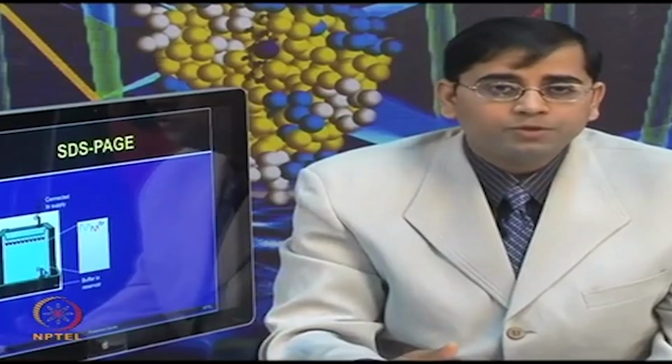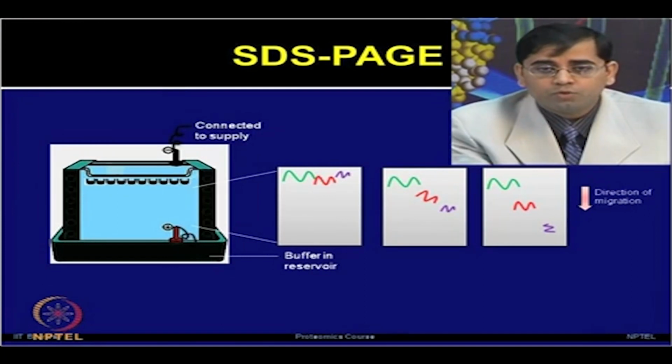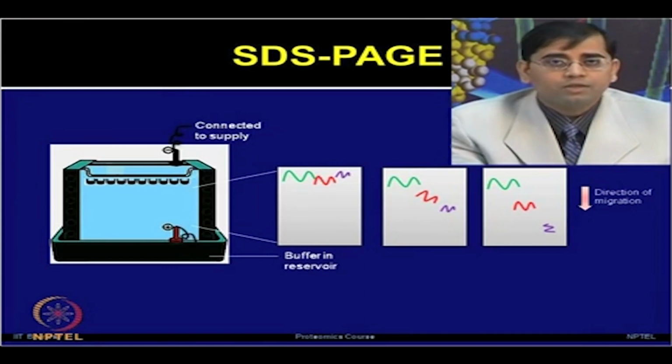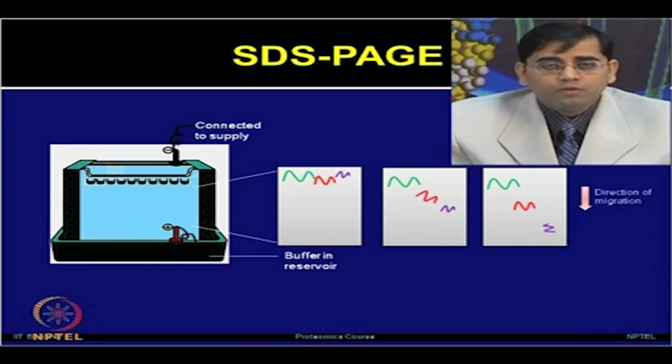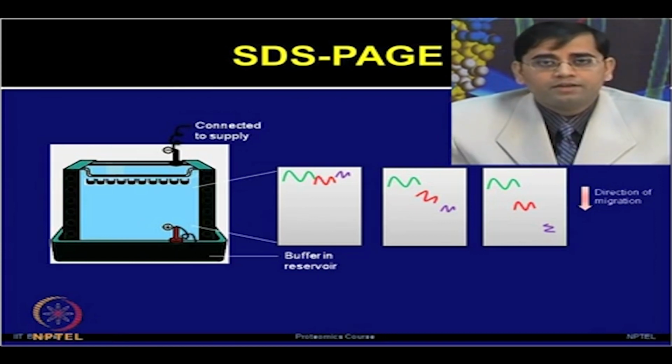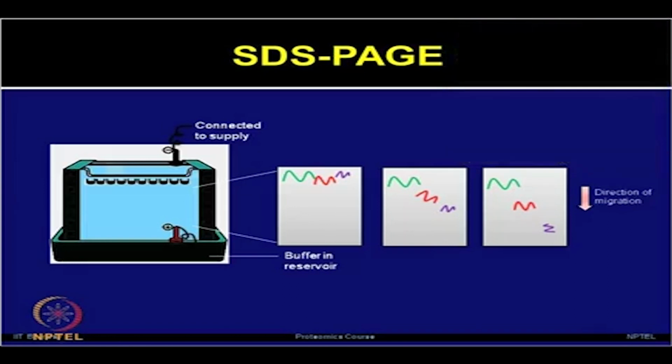Once this protein preparation is done, then you can load this protein on SDS page gel, and based on the molecular weight, the lower size proteins will migrate the furthest and the higher molecular weight proteins will remain near the top surface of the gel. So, depending upon the protein size, you can separate the protein based on the lower and higher molecular weight in this SDS page gel. You can add the standards or known molecular weight proteins to determine your unknown proteins.